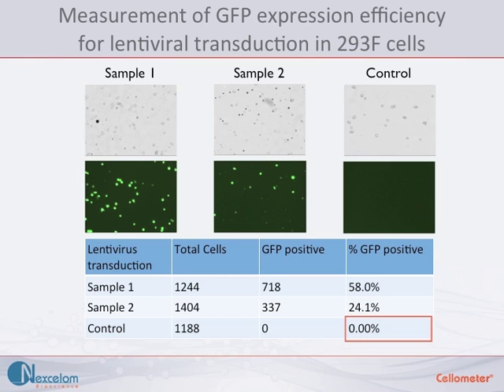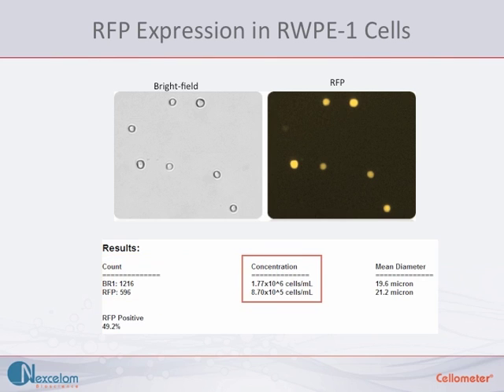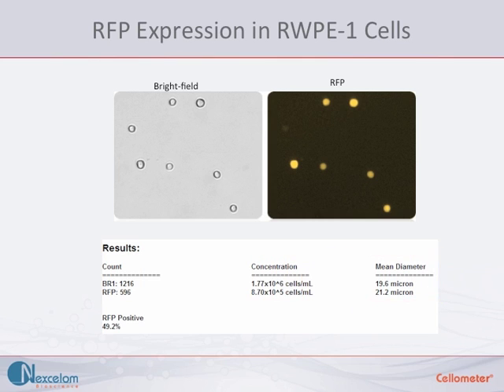Similar to GFP expression, we can also detect RFP expression. Shown here is RFP expression in RWP1 cells. Brightfield and fluorescent images were acquired, and the data output table shows the number of cells counted, the concentration of brightfield cells and the RFP positive cells, their mean diameter, and the percent of RFP positive cells.